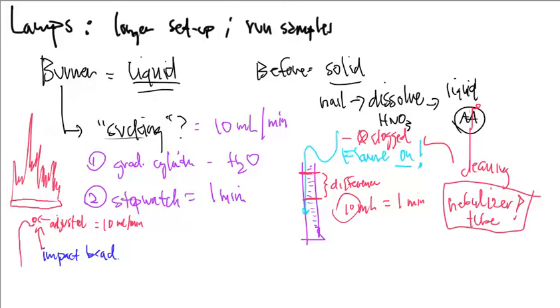All right, so we're not even talking about the burner head yet. This is kind of a piece that's attached to the burner head. And this is one of the first things that I want to double check when I run samples for the day, or when a shift change happens and I come in and start taking control over the machine from someone else. I want to double check the flow rate before I start analyzing samples and wasting my time.